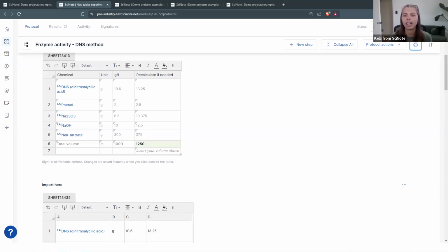Okay. Our next question is, can you round numbers in the cell to, for example, 3 decimals like you do in Excel? I don't know if Alenka, you want to talk about that one? Yeah, I can take over.